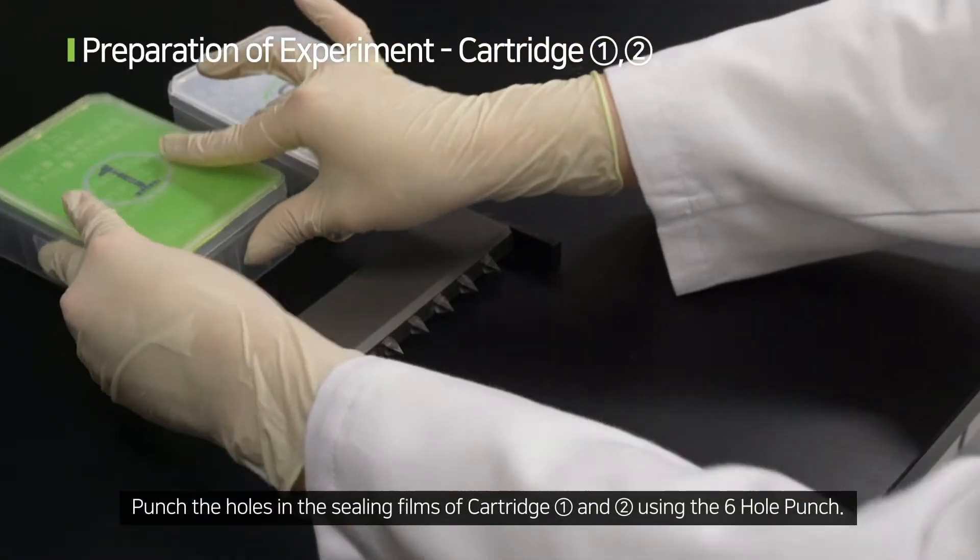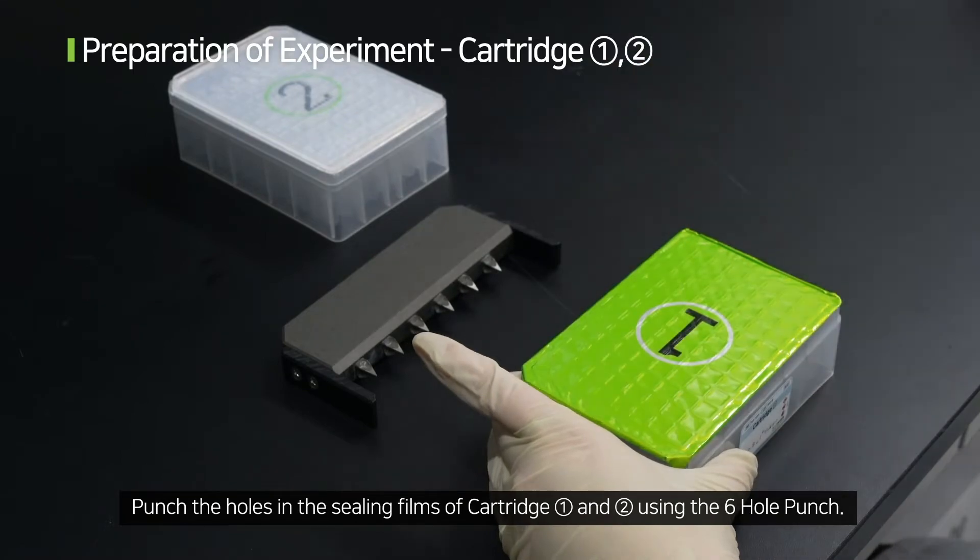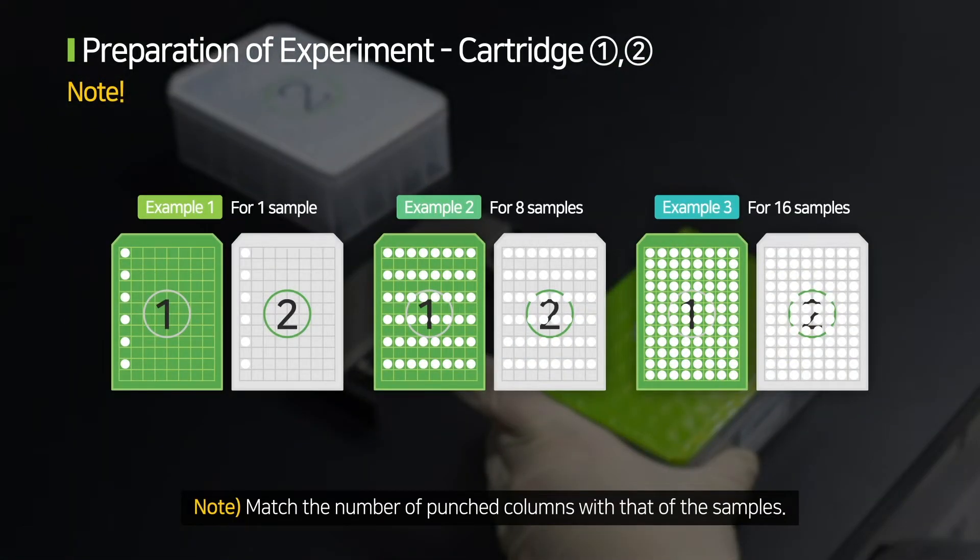Punch the holes in the sealing films of cartridge 1 and 2 using the 6 Hole Punch. Match the number of punched columns with that of the samples.